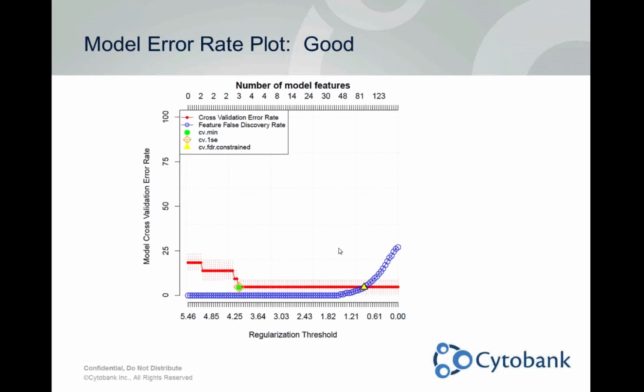for instance, our demo experiment that we have on all of our servers for CITRUS is just stimulating B cells with B cell receptor crosslinker and then looking at phosphosignaling outputs, that's a really strong signal. It's really easy to tell the difference. So the cross-validation error rate will vary. It doesn't have to go down to 0, and something as high as 40% might be okay. So just keep that in mind. It depends on your scientific question, whether or not you'll be happy with the cross-validation error rate. But in general, it's a good idea to see that drop over time.